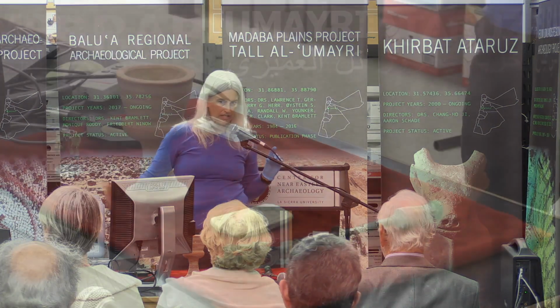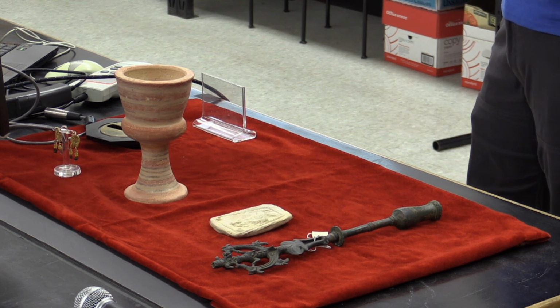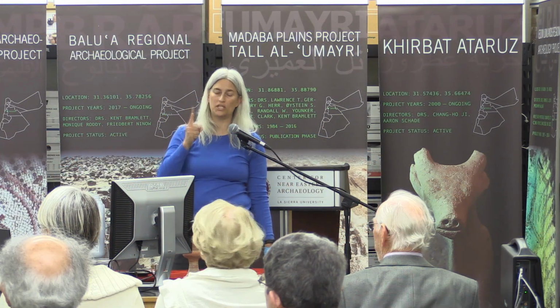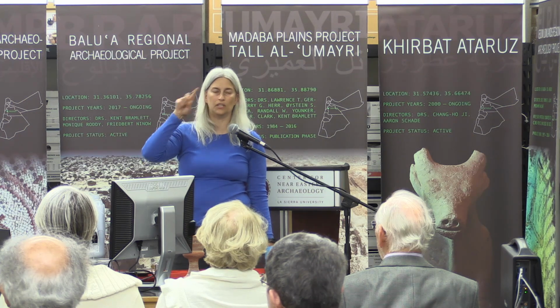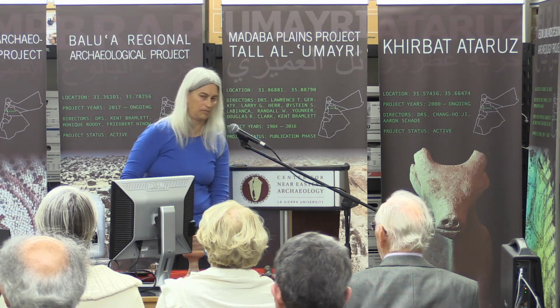Okay, and you can see there's two very, very large peaks. We're going to talk about the blue lines here in just a second. Red lines are the ones that we're interested in. We saw those come up as we took the scan. And those red lines are the electrons telling us, hey, I have this energy. And that tells us which atoms are present. Every atom's electrons are very significant of which one is which. So it's telling us information about which atom that is.